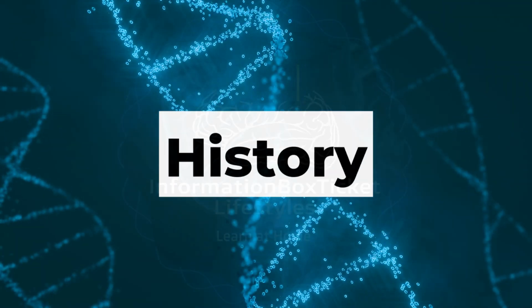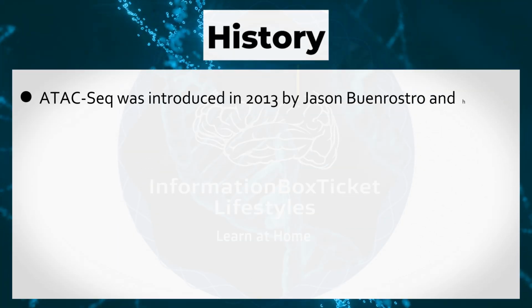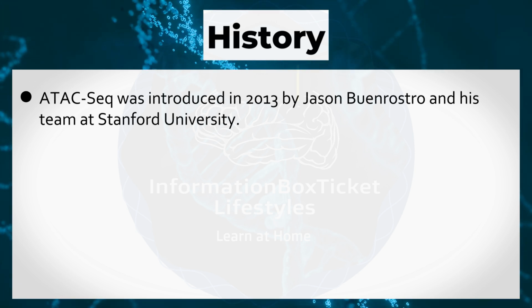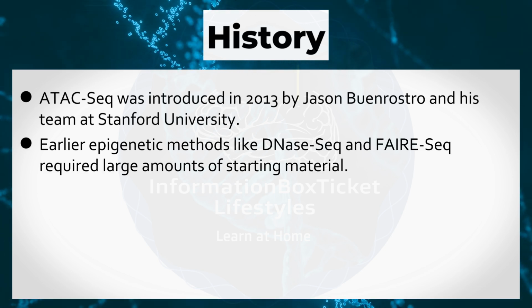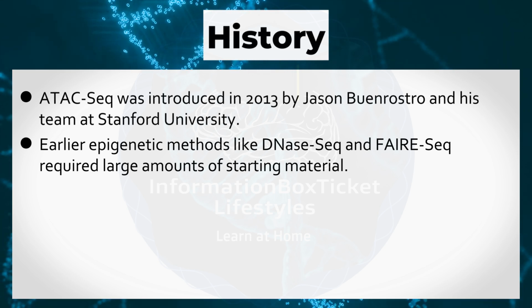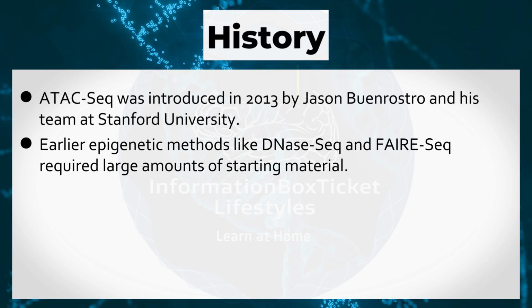History of ATAC-Seq. ATAC-Seq was introduced in 2013 by Jason Buenrostro and his team at Stanford University. Earlier, epigenetic methods like DNase-I hypersensitive sites sequencing and formaldehyde-assisted isolation of regulatory elements sequencing required large amounts of starting material.